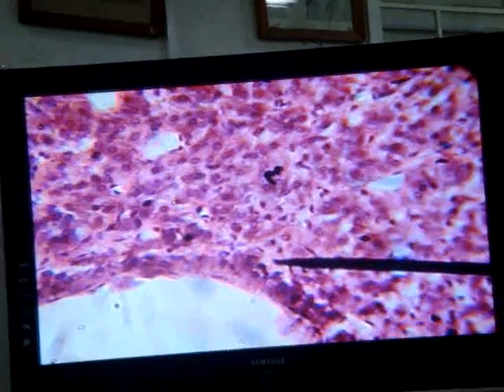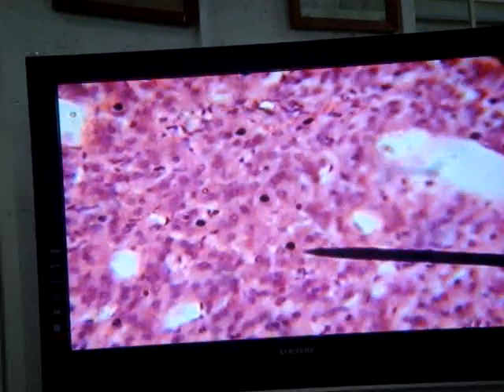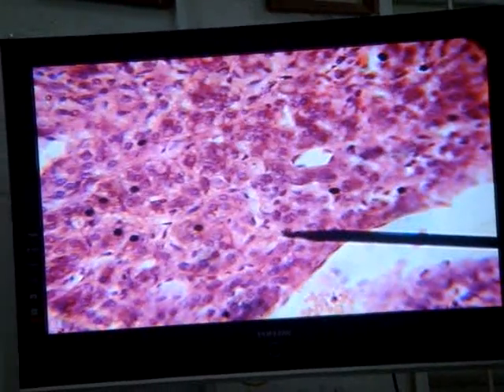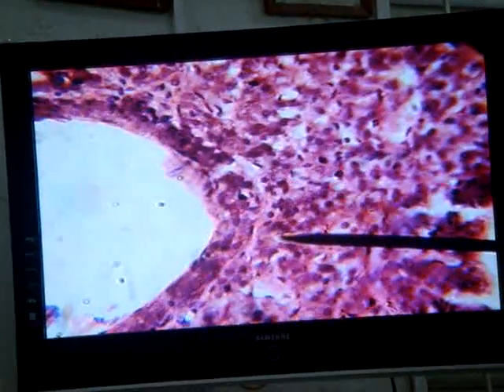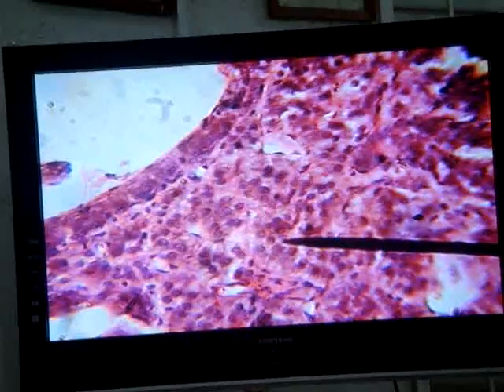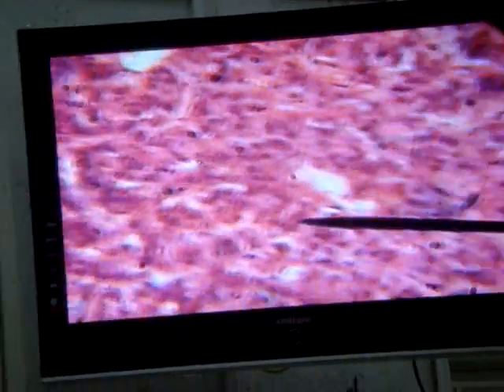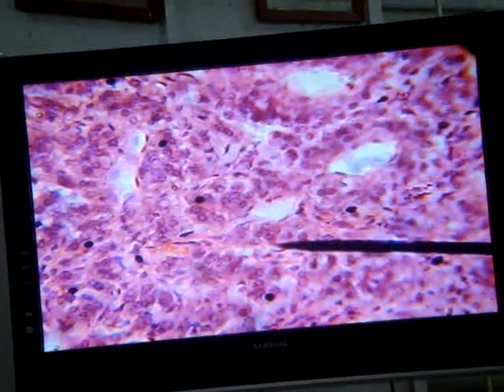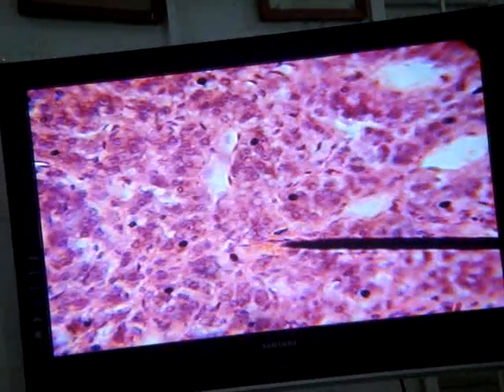Also, the medulla is composed of two kinds of cells. The two kinds are not always obvious, but I've brought one slide where I think we can differentiate the two. Generally, in the medulla we find chromaffin cells, the cells that produce epinephrine and norepinephrine. These would be the cells you're looking at right now. Those are chromaffin cells. Also, there are ganglion cells within the medulla as well. These ganglion cells are the ones that are difficult to find. I brought a slide where you can see them. And of course, this is a good example of a capillary with RBCs in it.